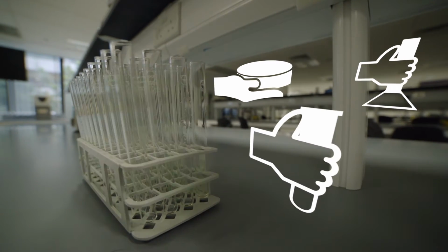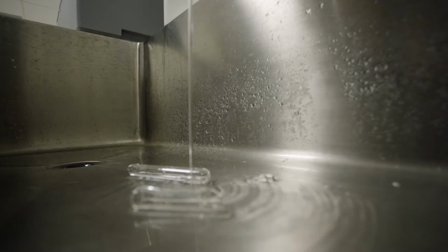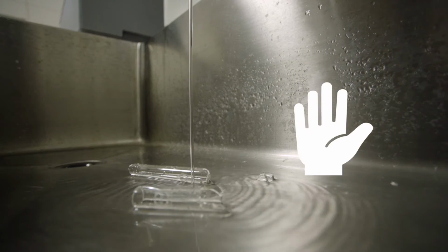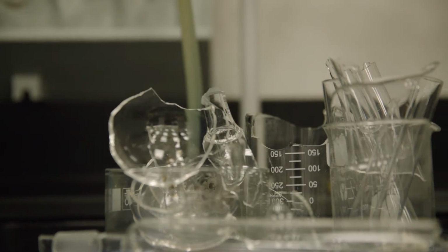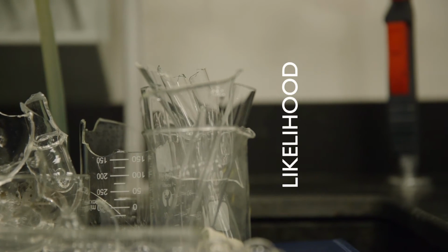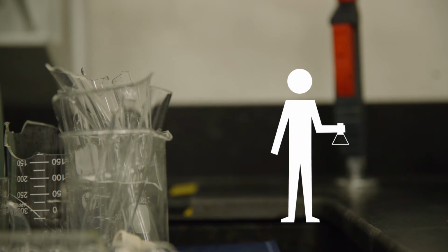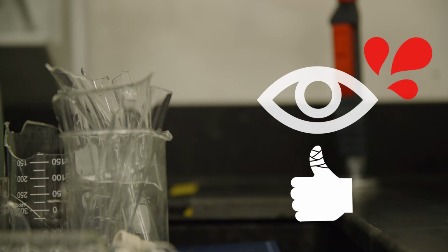Glassware is handled frequently in laboratories, and a common hazard is broken or chipped glassware. Anyone handling glassware is at risk of cuts and lacerations. To determine the risk level, you would need to identify the factors that could influence the likelihood and severity rating of the risk. For example, the likelihood would be higher if the person handling the glassware is inexperienced, and the severity would be higher for an eye injury against a skin injury.